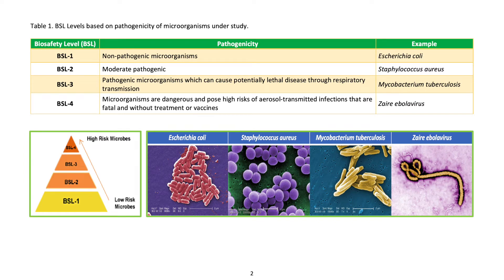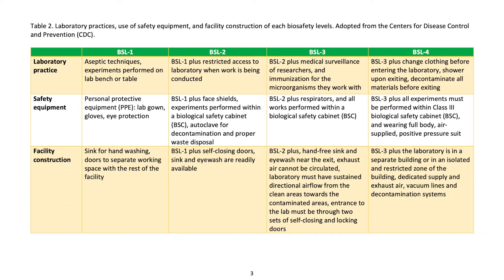BSL levels based on pathogenicity of microorganisms under study: BSL 1 — non-pathogenic microorganisms, example: Escherichia coli. BSL 2 — moderately pathogenic, example: Staphylococcus aureus. BSL 3 — pathogenic microorganisms which can cause potentially lethal disease through respiratory transmission, example: Mycobacterium tuberculosis. BSL 4 — microorganisms that are dangerous, symptoms are fatal and without treatment or vaccines, example: Zaire Ebola virus.